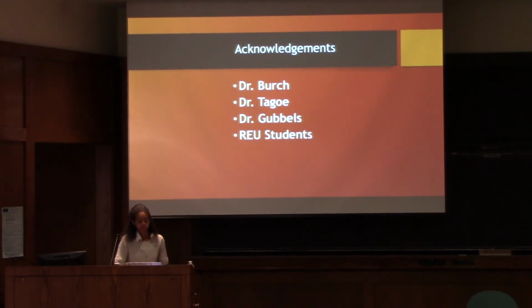So I have a question about your imaging of DDS1. You said that the construct that you were using is YFP labeled, is that right? Yes. So when you're imaging, were you using any live imaging of just the YFP, and how did that relate with the immunofluorescence of the fixed? So we didn't do any live imaging, it was just fixed imaging. And is there a reason why you didn't try live? So for about a month, our microscope was broken. So when it began working again, I just focused on fixed imaging.